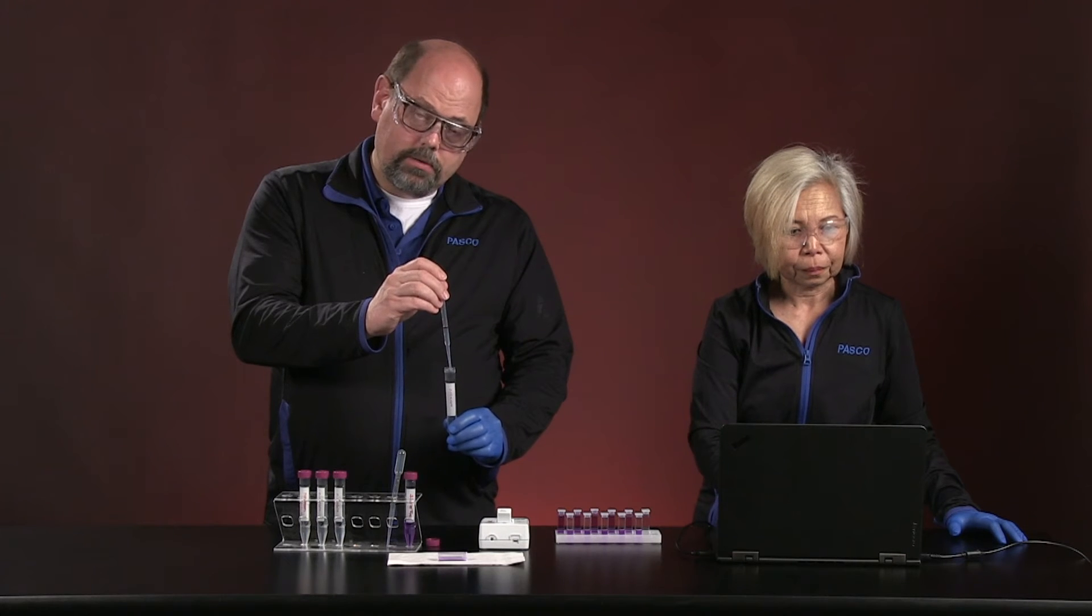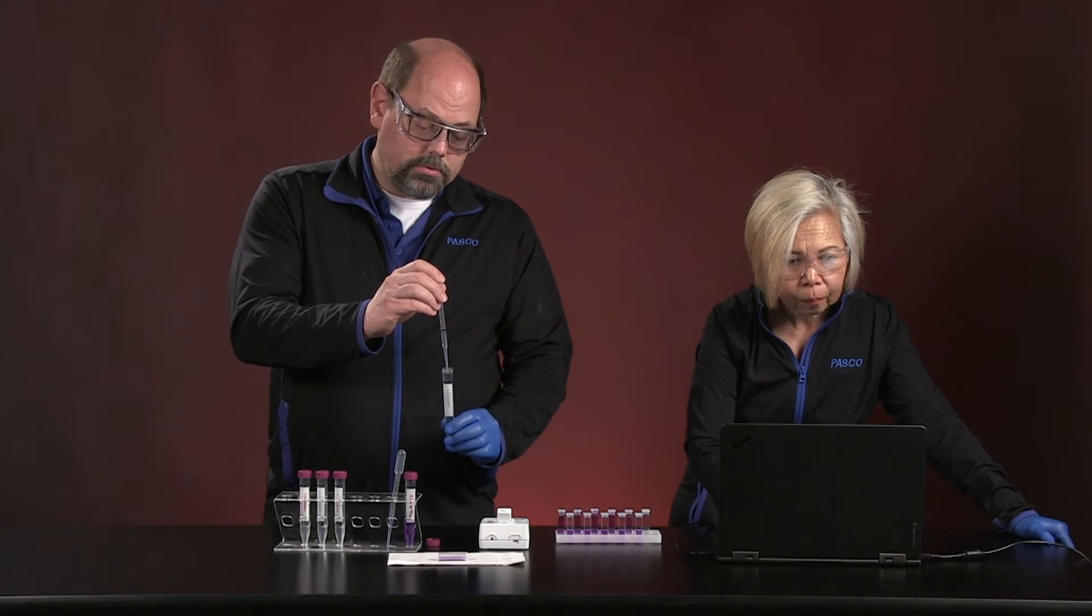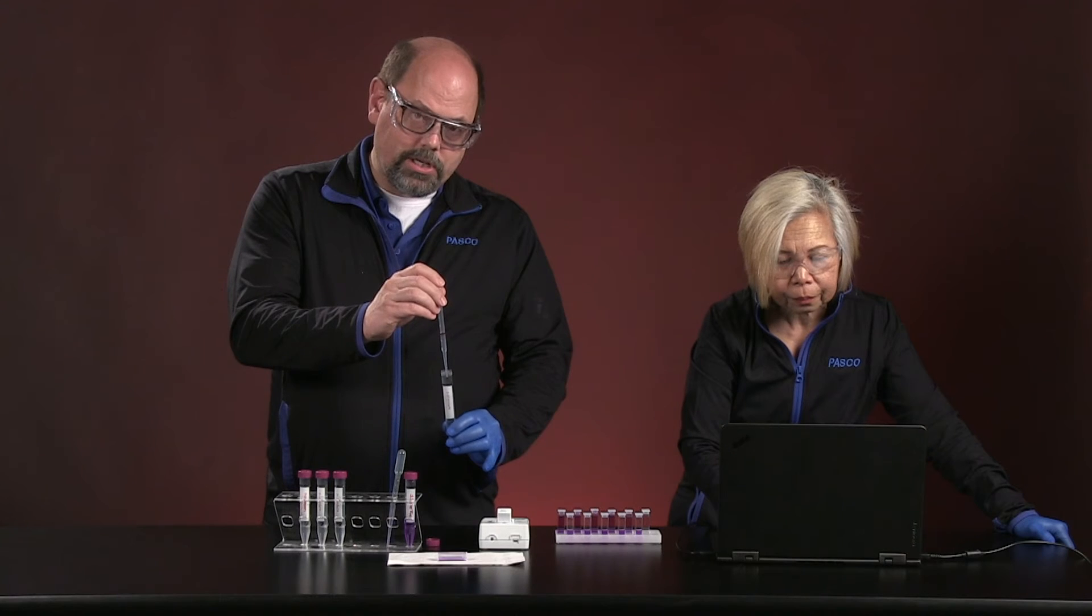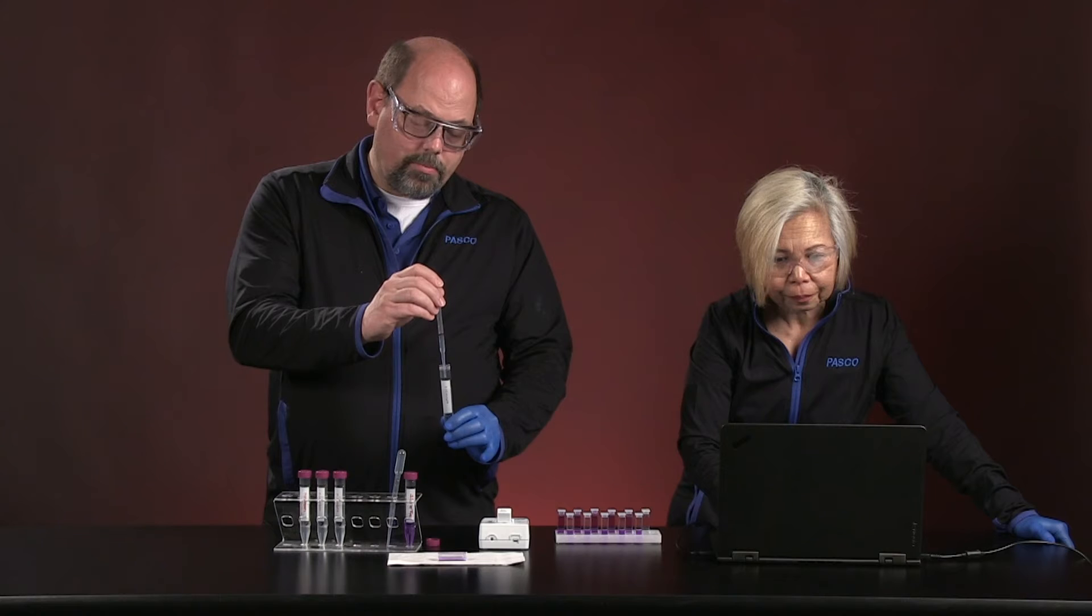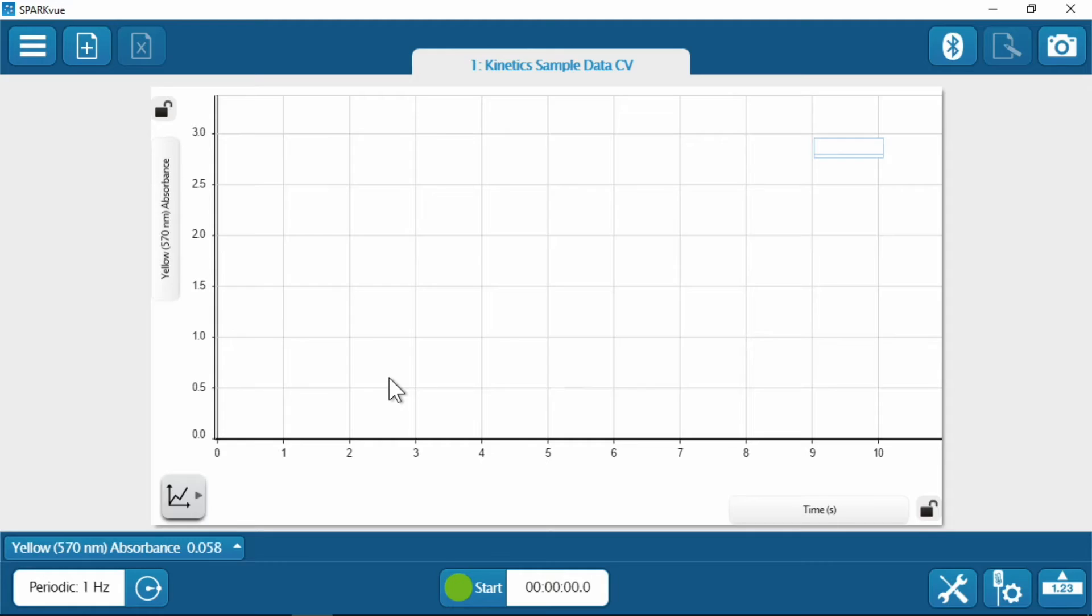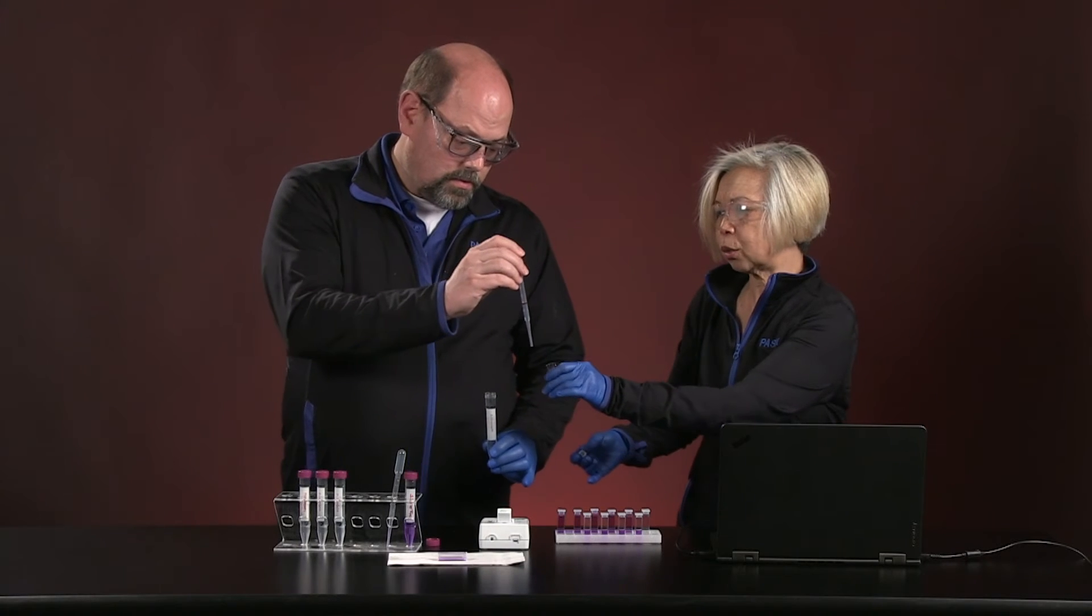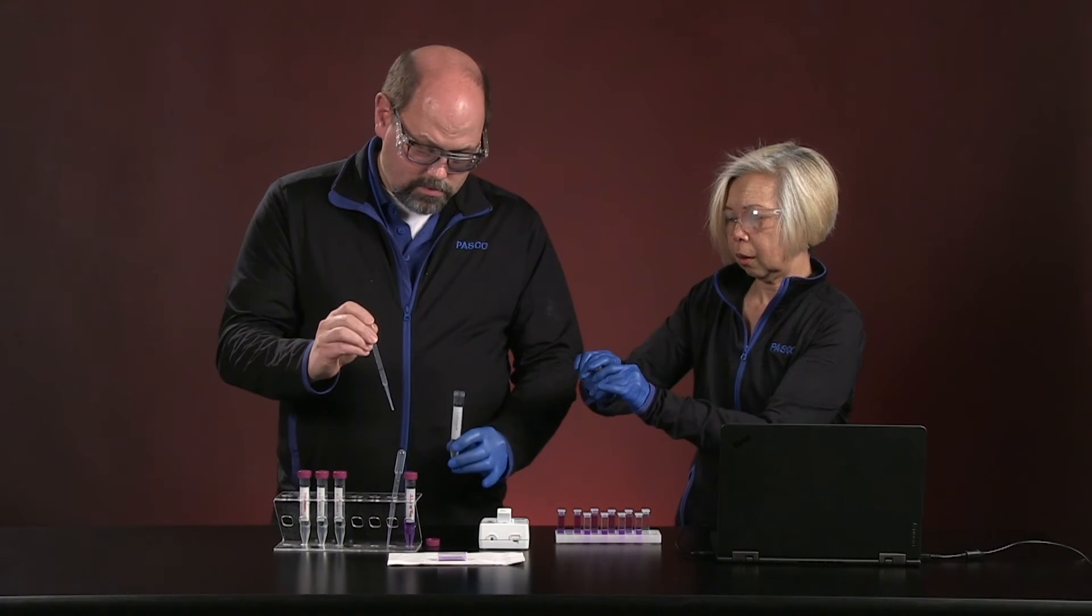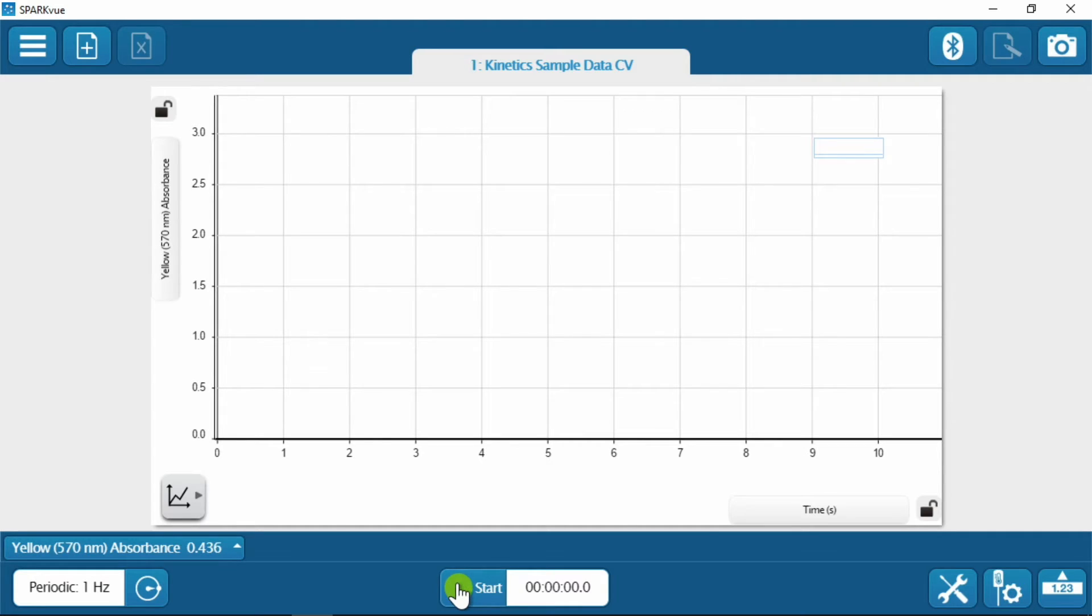I'll put this into the solution and that will slowly cause that purple crystal violet to fade. We're going to put this in the cuvette reader and we're going to watch as that yellow absorbance starts to come through. Remember, yellow is being absorbed and it's going to go away. Okay. Are we ready? I think so. Okay. So we're going to work as swiftly as we can. This is why it's great to have a partner like Roger working with you. Put that in and we're going to press the start button.